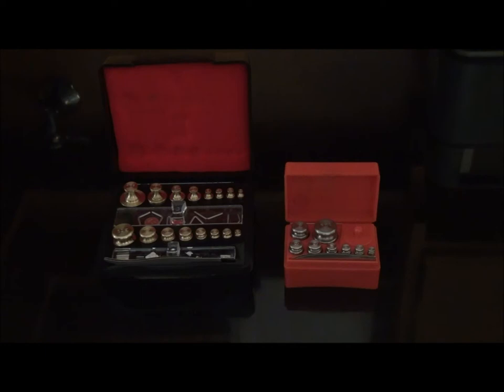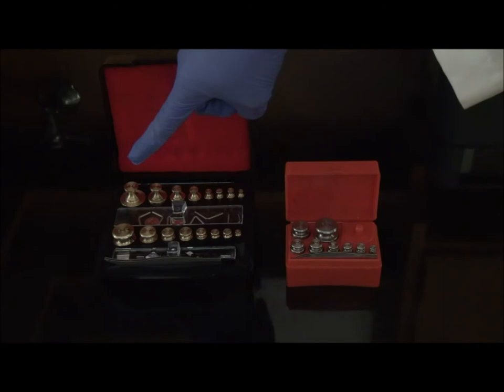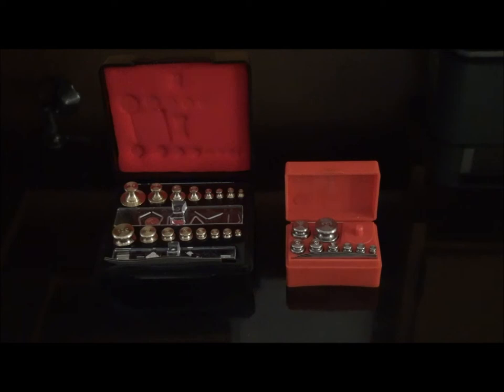Metric and apothecary weights are packaged as a set in a sturdy compartmentalized box. Newer sets consist only of metric weights, as there is a decreased need for apothecary weights in modern practice. Metric weights are easier to use than apothecary weights, but it is best to become familiarized with both systems, so we will be providing an overview of both.